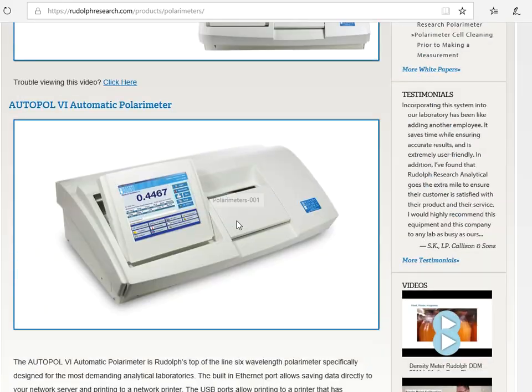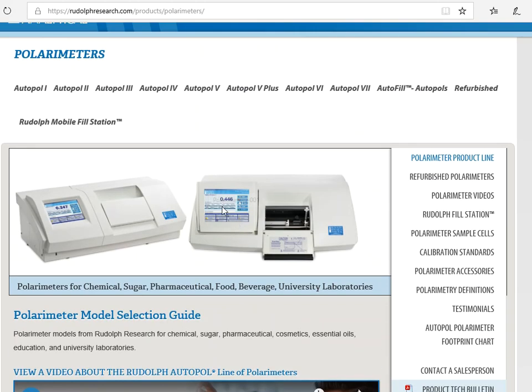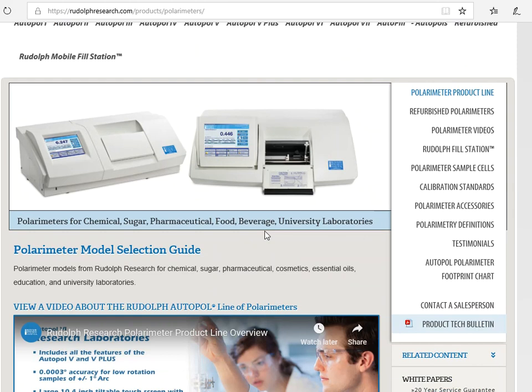All right, so the same thing's going to happen here. I'm going to post a couple of videos that I would like for you to watch about the polarimeter. We're not going to be bogged down in the theory about how this works and what happens. I just want you to kind of have a general overview of the purpose of this equipment, and that's exactly what it does. As long as you understand that this machine is used to measure rotation of light, either left-handed or right-handed, from a molecule, then I think that you're good enough.